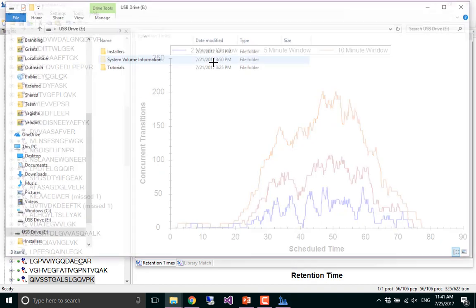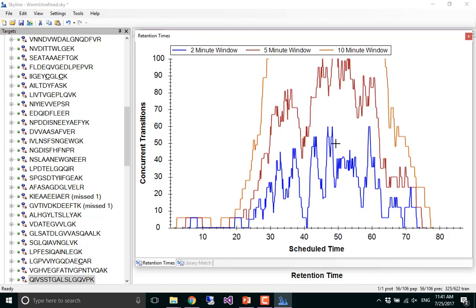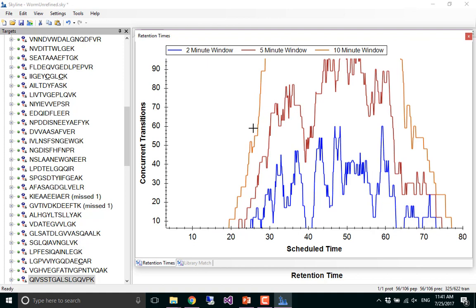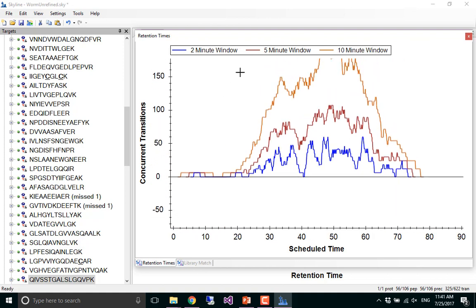Here, I think, most modern mass spectrometers would be just fine with 100. Right? So we could do a little more than 100. And that would be a 5-minute window. So we could export this into a single method with a 5-minute window. So let's go do that.